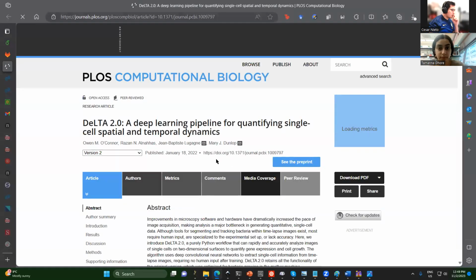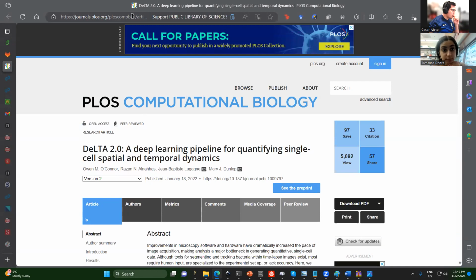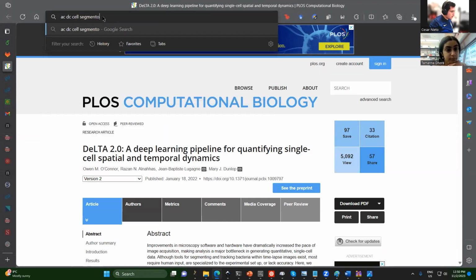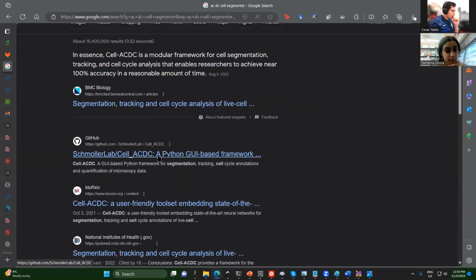Of the segmentor, I know there's a famous one, but I haven't had time to check: Cell ACDC.